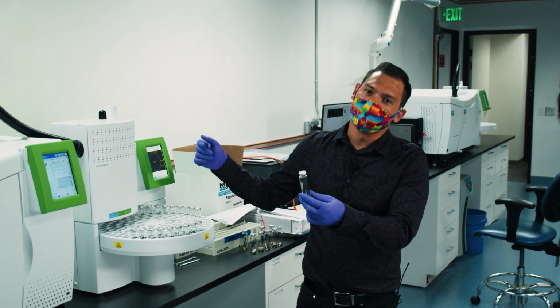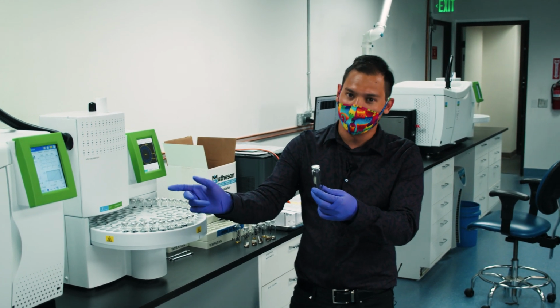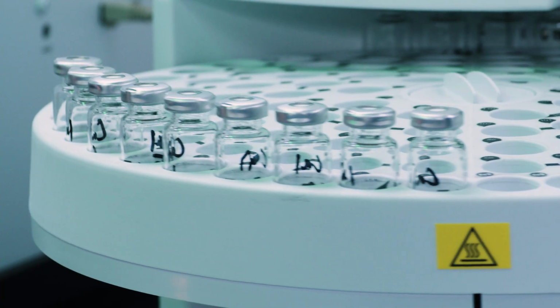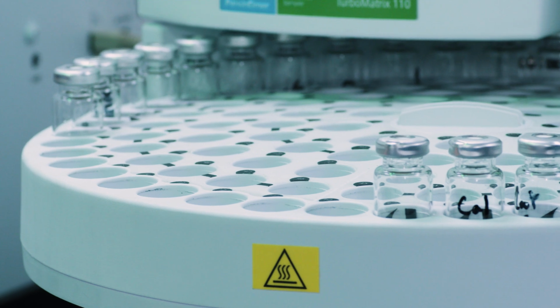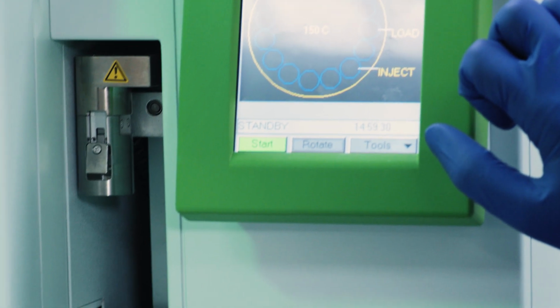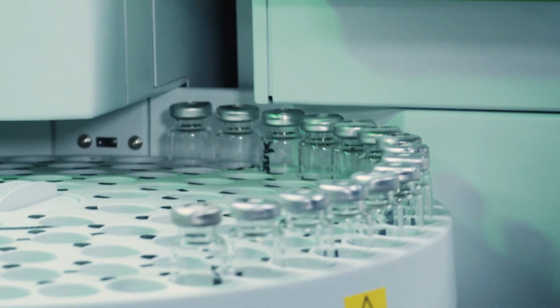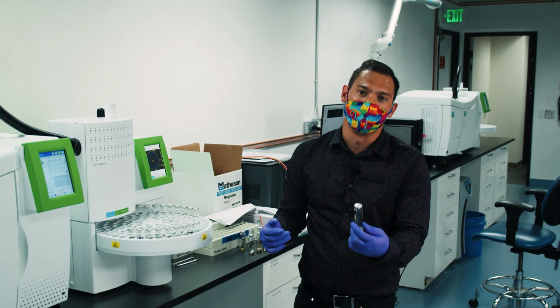And what happens is we're going to take a small sample of the gas and then run it through the gas chromatograph. What the gas chromatograph does is it's going to separate out all the different components again, and then we always have a detector at the end, right? So this is a headspace gas chromatograph coupled with a single quad mass spectrometer. From there, we can actually quantify what types of residual solvents are within our sample.